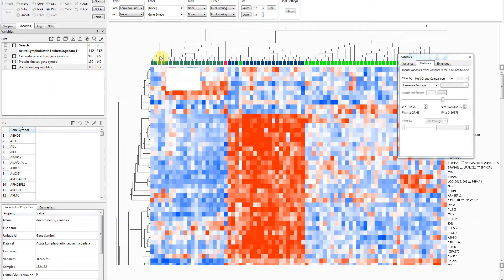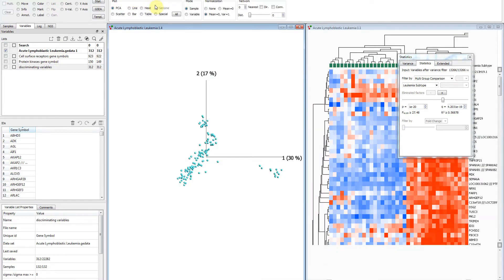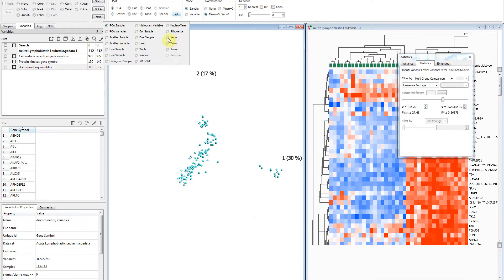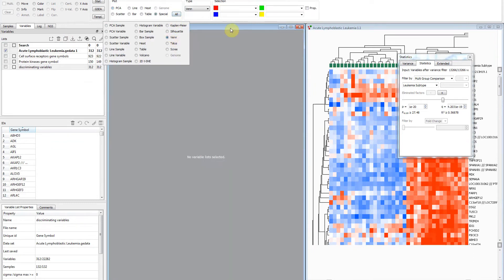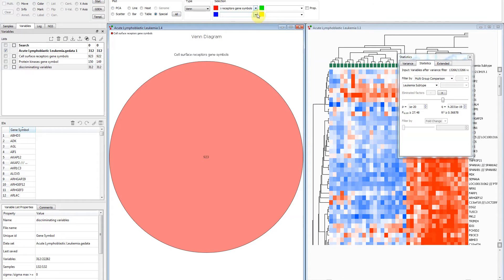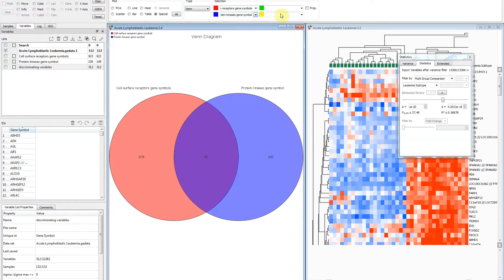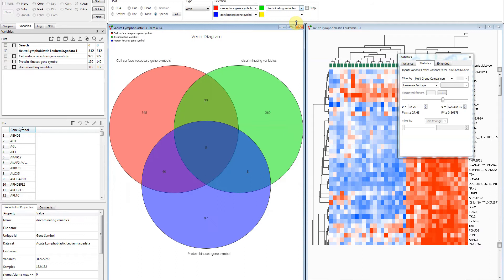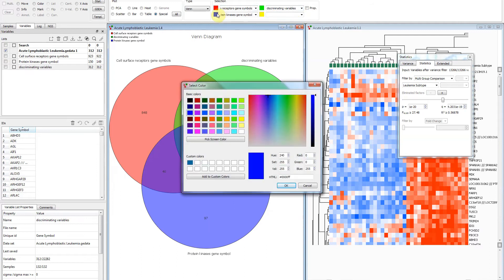We create a synchronized plot and configure it to be a Venn diagram. The lists to use are selected in the Method tab. Add the three lists.